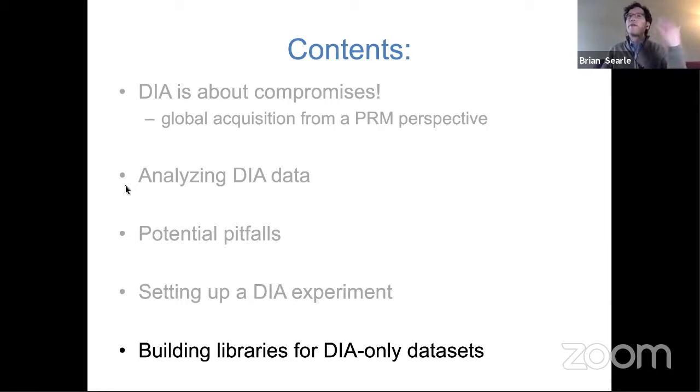It's just 1 out of 20 amino acids in that particular case that can fall on that N terminus. As you start to narrow your way in, those frequencies get less and less. And so typically we don't like to extract a lot of data that's B2 or Y2 as being significant. And typically we start to count after Y3, unless you need a specific ion to call that peptide. So for example, if you have a phosphopeptide and that's the only ion that can help you.